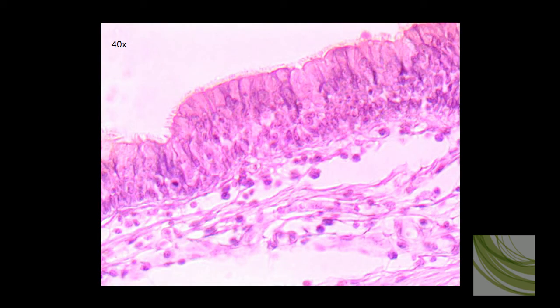And here we can see that same slide using the 40X objective. And we can see very clearly the cilia. Here's the basement membrane that runs along. This would be the apical surface, and we can even see the various nuclei mixed in here, and what looks like a few goblet cells mixed in as well.